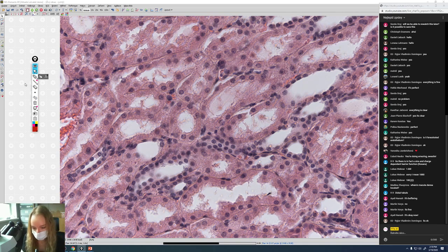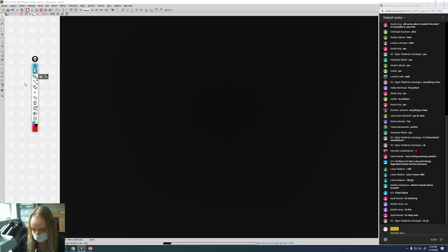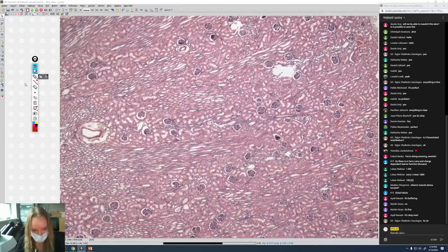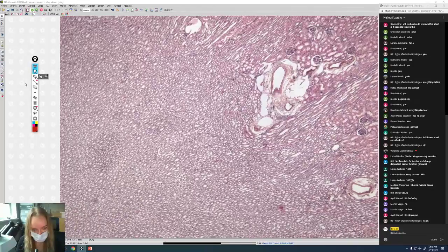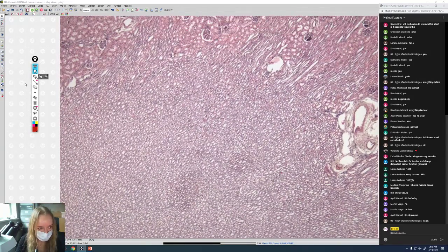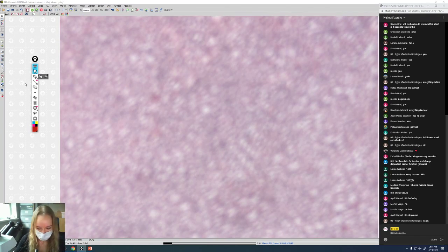So okay, we can distinguish the proximal tubule from the distal tubule. And now let's move to the other tubules. We're still in the cortex, and you already know we're going to be looking for the loop of Henle and the collecting tubule in the medulla. So we're back in the medulla, and we're going to look for the other tubules here.